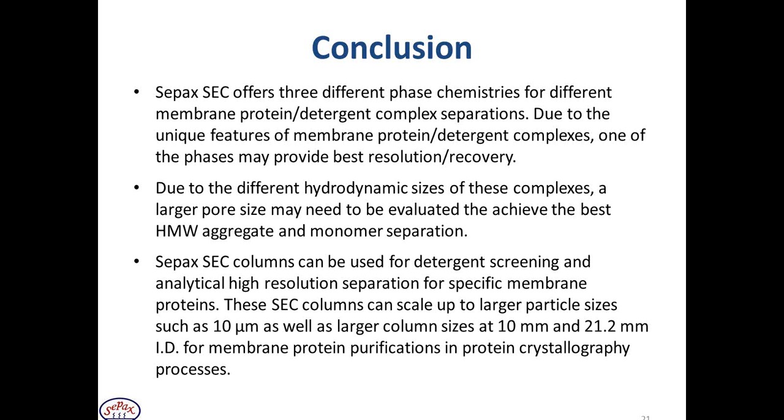These SEC columns can scale up to larger particle sizes, such as 10 micron, as well as larger column sizes at 10 millimeter and 21.2 millimeter inner diameter columns for these membrane protein purifications that are done in protein crystallography processes.